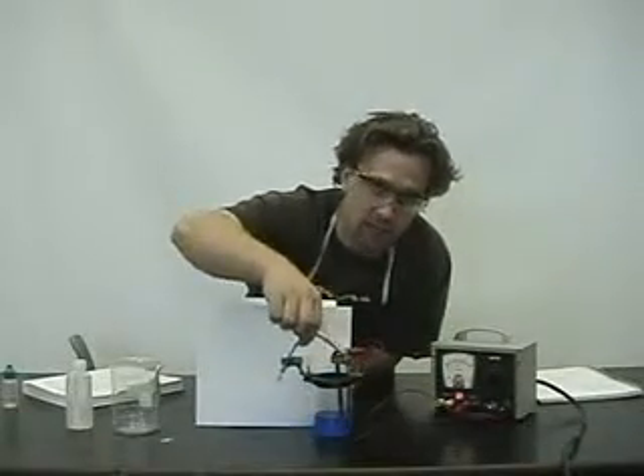So what we're going to do today is we're going to do some electroplating. I've taken one of my keys here, and we'll do a little zoom in later on it, and we're going to electroplate it with copper.